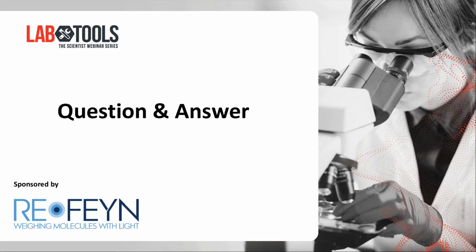Yeah, I'm not sure if I understand this correctly, but you can, of course, filter your data set by mass, or I don't know in which direction this question goes. Yeah, I think it's asking if there's a way to actually collect the proteins from the slide to do further analysis if they are multimerizing.